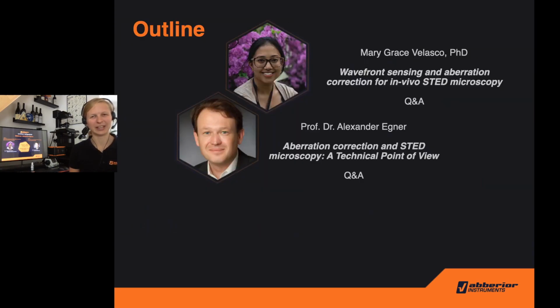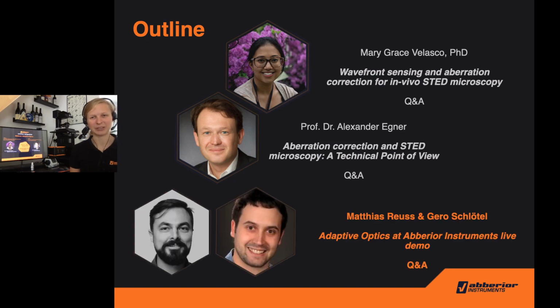Our topic for today is Adaptive Optics STED Microscopy, and we have in total 4 excellent speakers today. First, Mary Grace Velasco and Alex Egner will give a short talk each about their research on adaptive optics in STED microscopy. Next, my colleagues Matthias and Gero will introduce us to how we have implemented adaptive optics into our own confocal and STED microscopes at Abberior Instruments. And then they'll show us in a live demo how adaptive optics improves STED and confocal imaging quality in thick samples.